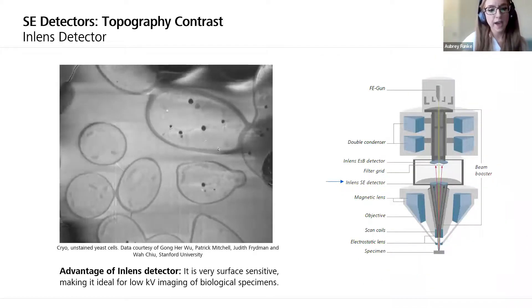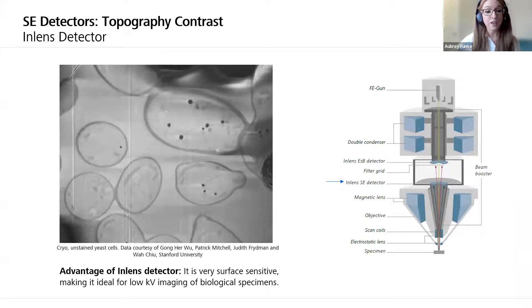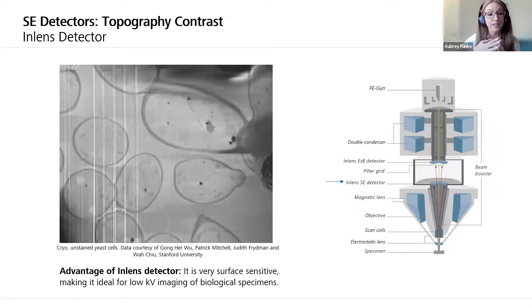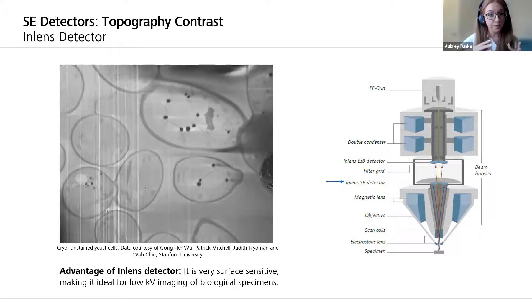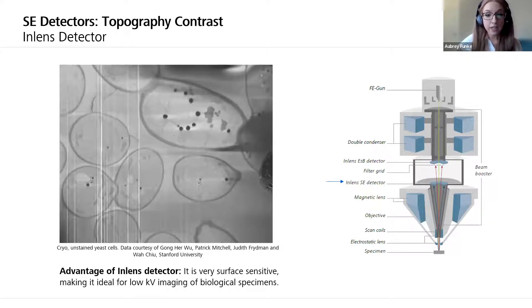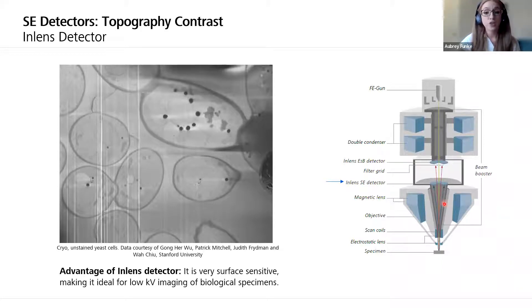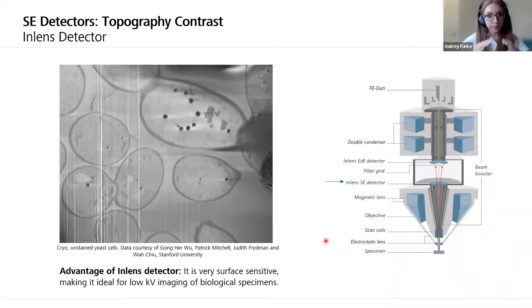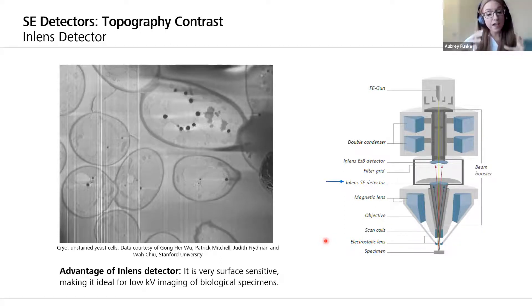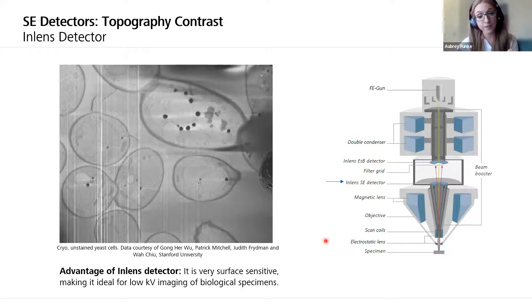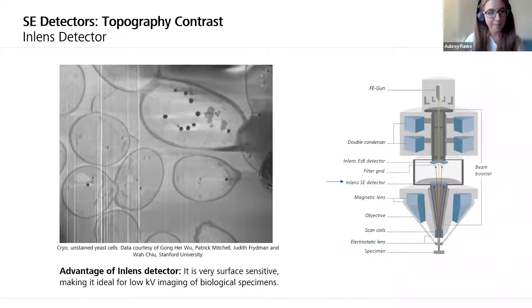Another type of secondary electron detector is the in-lens detector, which is really amazing for life science samples because it's very surface sensitive — really important for biological samples that maybe don't have a lot of contrast. Located in the column right above the lens, it detects secondary electrons directly in the beam path. This video shows unstained yeast cells being milled by the focused ion beam within the FIB-SEM — completely unstained, not heavy-metal treated whatsoever — and all of that contrast is simply brought out by the sensitivity of that in-lens detector.